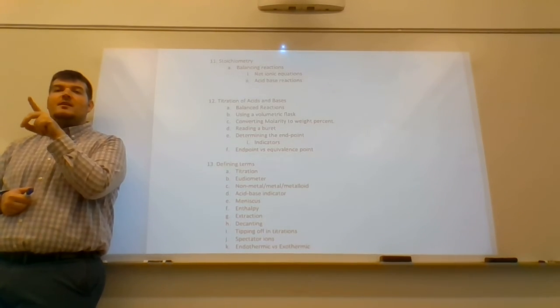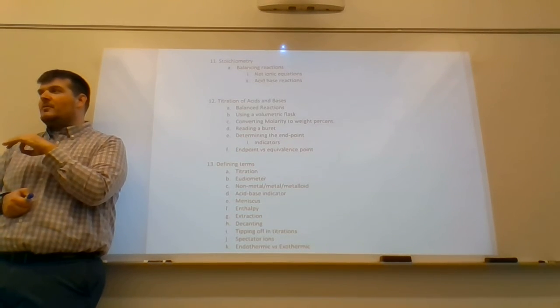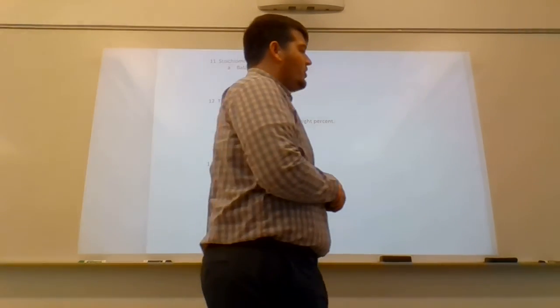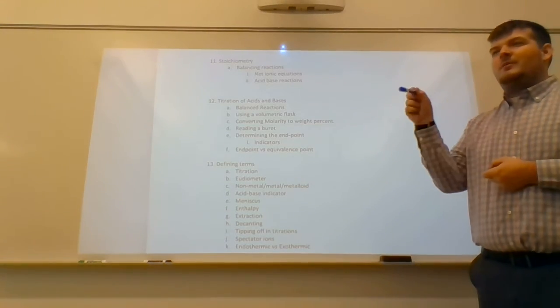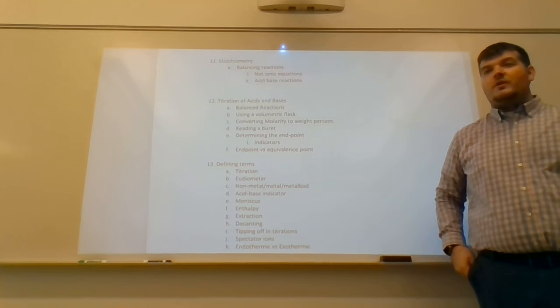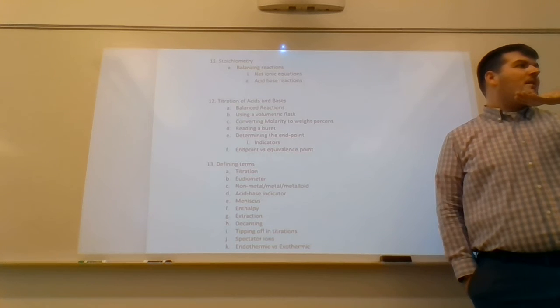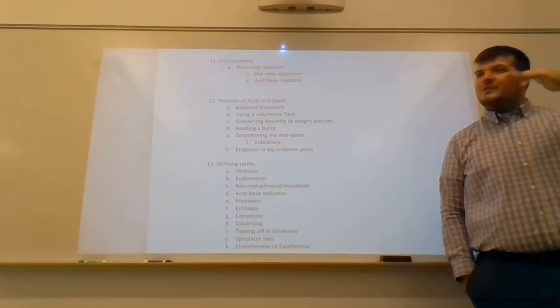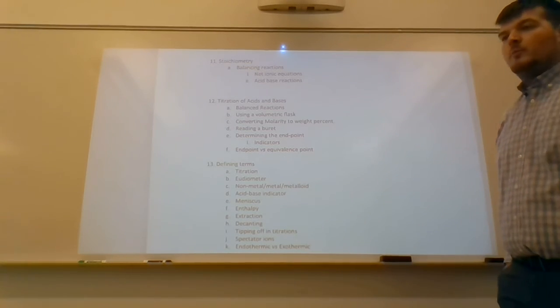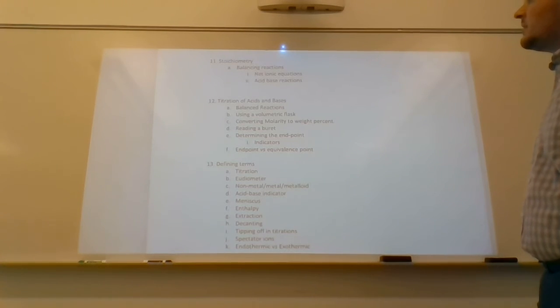How many significant figures are in your volumetric glassware? 4. So 250.0, 100.0, whatever the case is, okay? Your glassware on the outside of it also tells you its tolerance. It's basically how good is that last digit. So remember, all values are all known except one estimate. So is it 250.0? If you fill it to that mark, maybe, but it has a little bit of wiggle room there too, right? Because it's an estimated value. On the outside of your glassware, it'll tell you how much wiggle room you have. You don't need to know that for the practical. I'm just telling you.